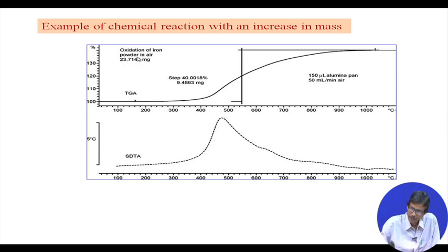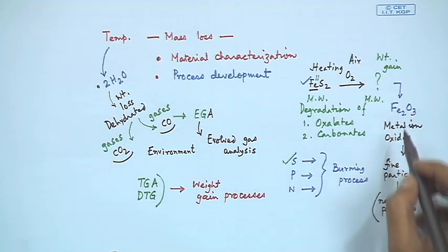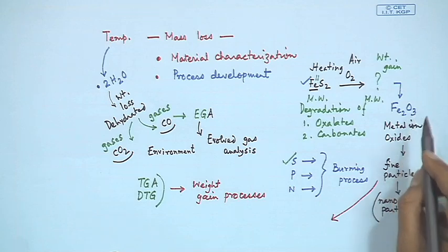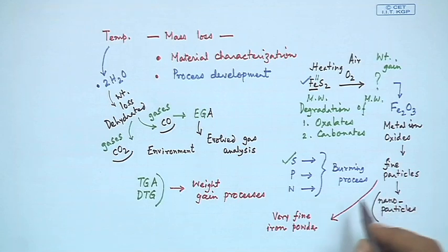So, what we have seen just now is something related to semiconducting oxide material. Fe2O3 is your oxide material, but if your environment is such that Fe2O3 can be converted to very fine metallic iron powder, what should we do?